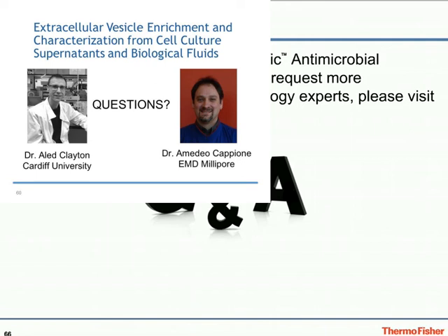And if you also have some cell death there, it's very possible that you have contamination of your vesicle prep with apoptotic material, other forms of cellular debris. And again, depending on how you prepare your vesicles, that may be a huge contamination or a less impactful contamination. So certainly with respect to serum starvation, it is an issue. You need to think hard about it and validate your system before you launch in, I think.